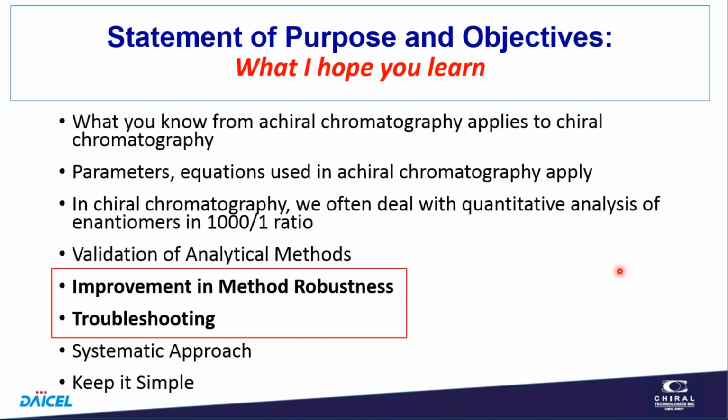As I was putting this talk together, I was thinking about the things that I do on troubleshooting, and many of the same tests and questions we have in method robustness are issues around troubleshooting. I don't have time to talk about troubleshooting per se, but I did want to point this out. Many of the things we investigate in method robustness are the same kinds of experiments or tests that we would do in troubleshooting.